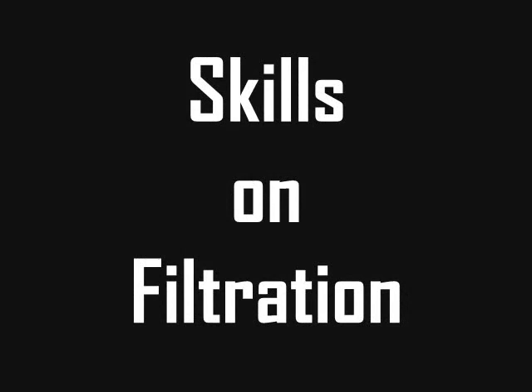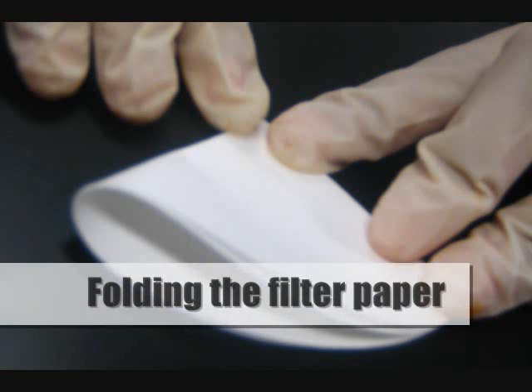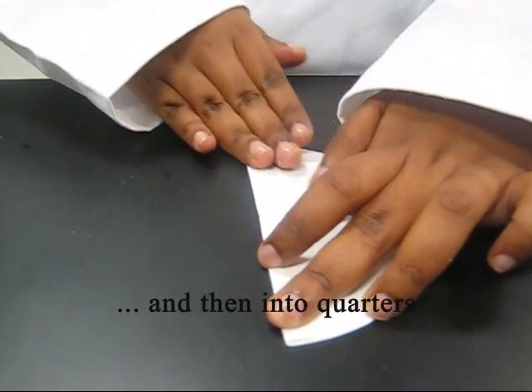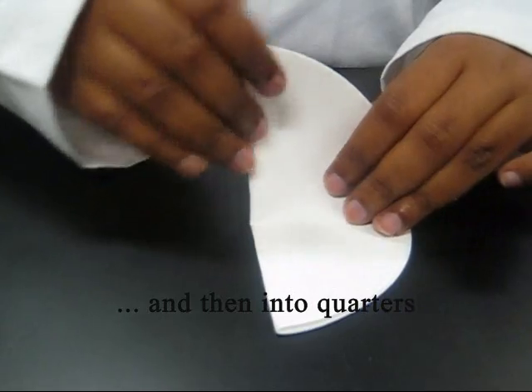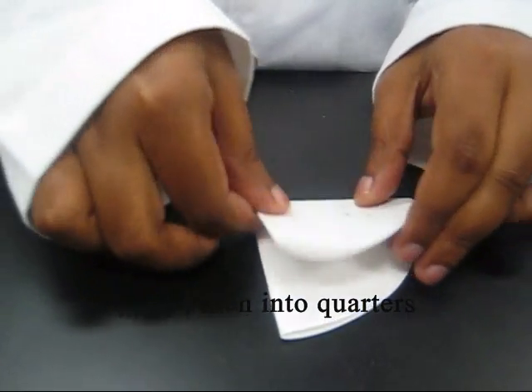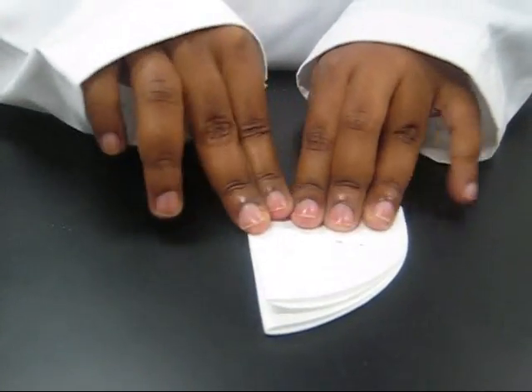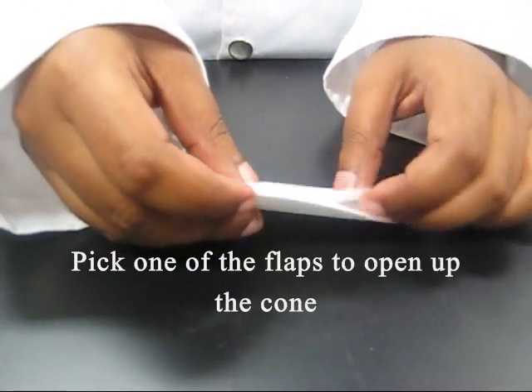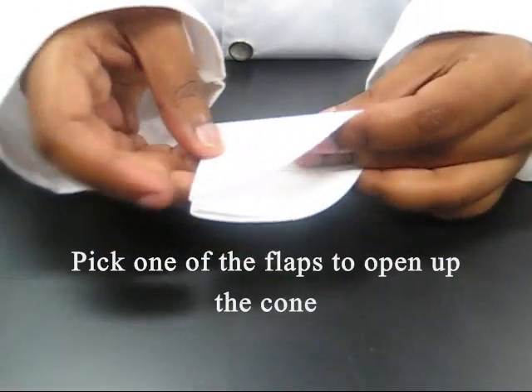Skills on filtration — folding the filter paper: fold the filter paper into half and then into quarters. Pick one of the flaps to open up into a cone.